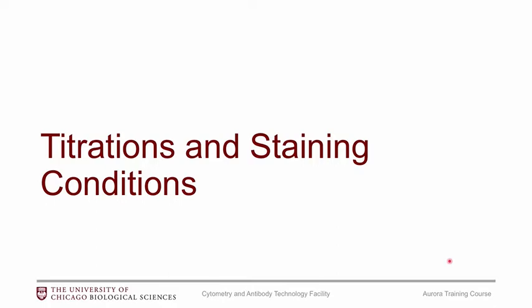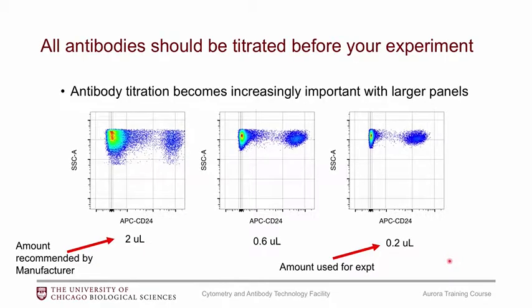A few reminders about titrations and staining conditions. You definitely want to titrate your antibodies. As your panel grows larger, it becomes much more important to titrate. If you use an antibody at the manufacturer's recommended amount you get spreading, whereas if you titrate it down everything looks much nicer with less spreading. Titrating your antibodies will help you get the best possible results.